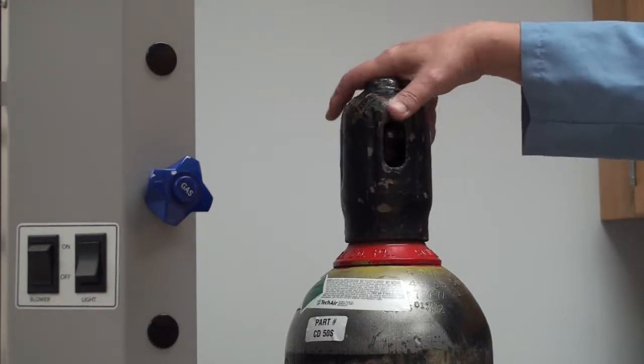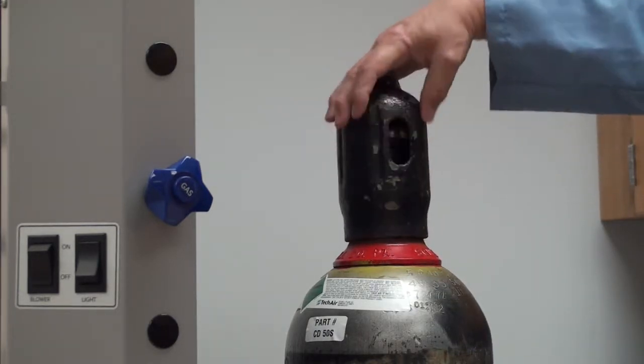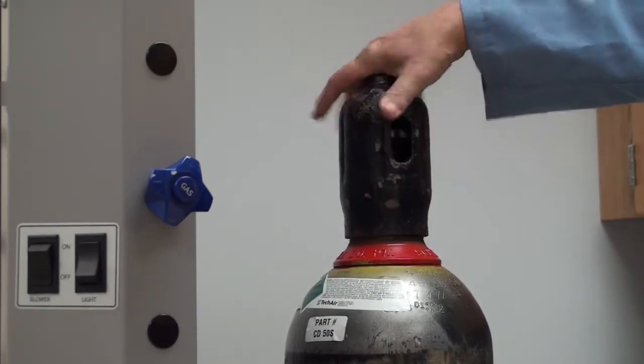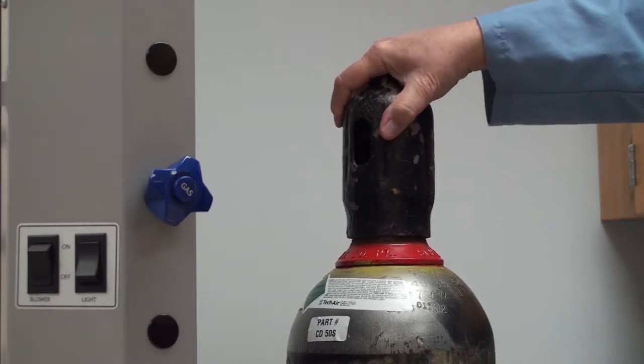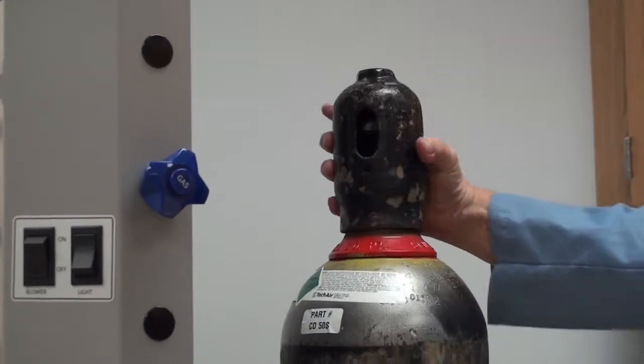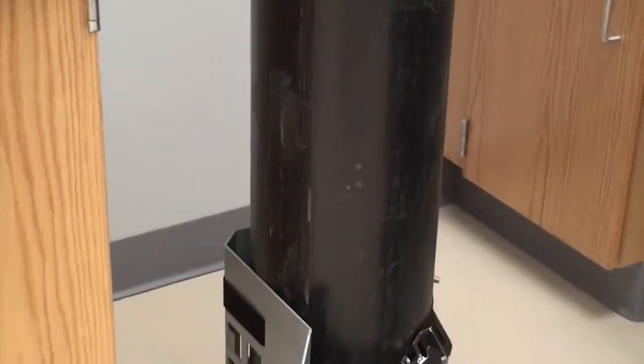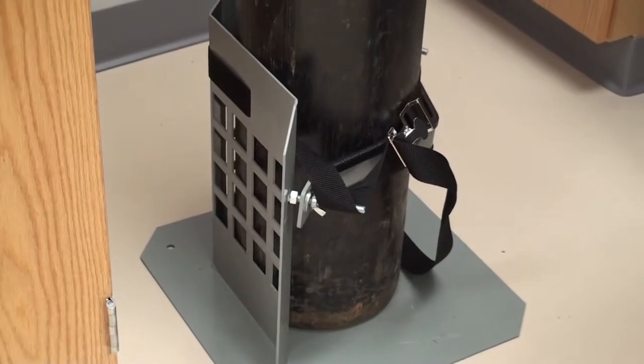So you need a liquid CO2 with a dip tube. Once you have the tank, remove the safety cap. Always make sure that you either have the tank tied down to something, an appropriate system that is safety approved. In this case, for our lab, we have a proper stand for it.